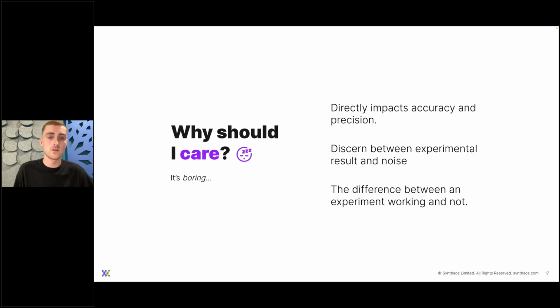And why is it important? Why should we care? It directly affects accuracy and precision. If you didn't do this, you couldn't be sure that the correct amount of maple syrup was added to your mixture. Of course, this doesn't really matter too much when you're baking cookies, but imagine you're doing a highly sensitive, miniaturized biology experiment. It's crucial. And after all, one of the main selling points of moving towards automation, other than maybe that coveted walk away time, is the accuracy, precision, and repeatability.